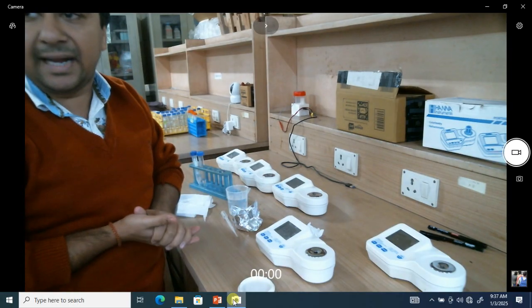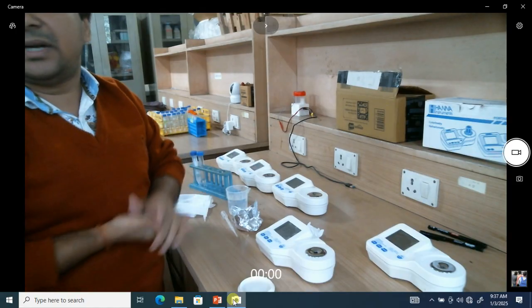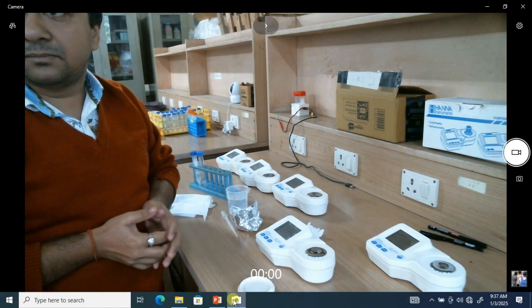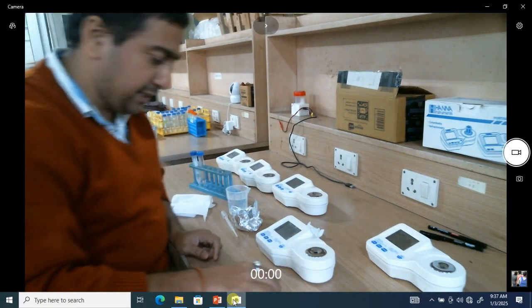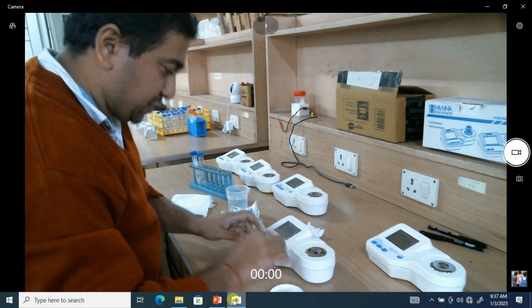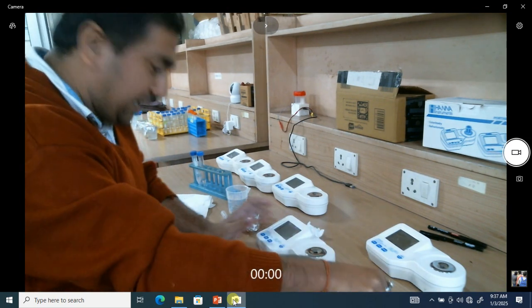Also, you have other modes. Depending on what you want to measure, you can take the other modes. Take both ND and ND20 readings. So how will we do ND20? I'll show you in the next part. We'll now switch it off because we have already done this part. Again we will go for the calibration at first.